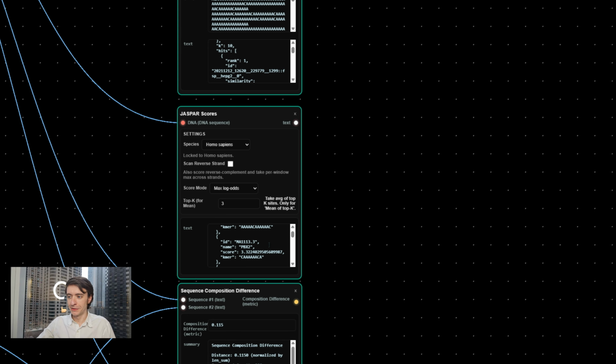All right, everyone. So our model finished running. It took about a minute and a half here, very fast. So I'll walk you through what it did step by step here. Once again, it took this DNA sequence.